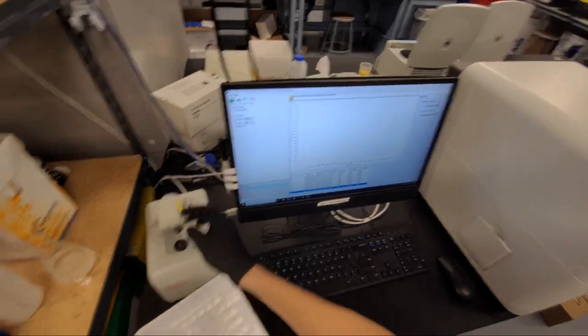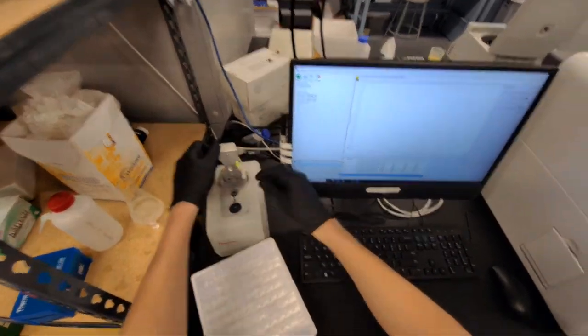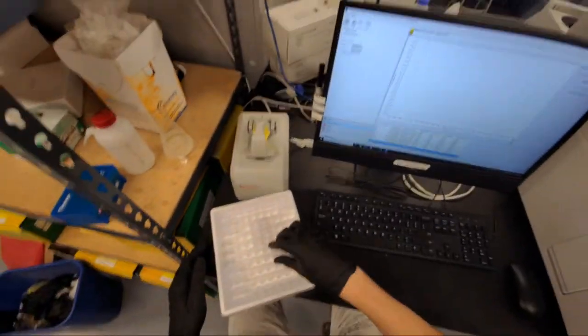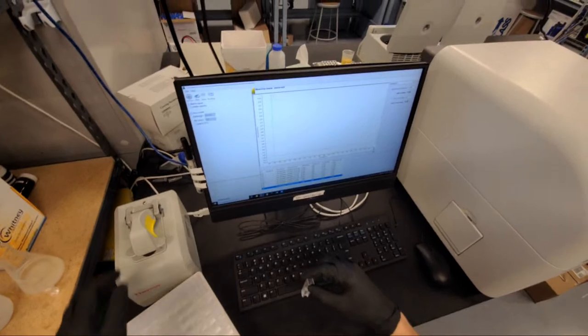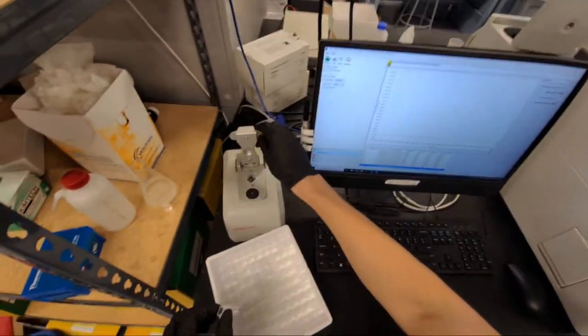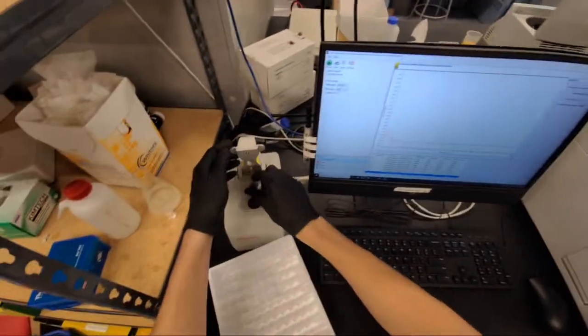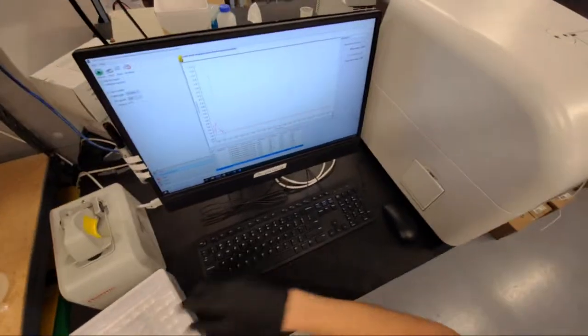So we will need to multiply all these readings by 20 to get the proper measurement. And that last one, it was 0.359 and then 0.337. Not too bad. But that's why we want to do these technical replicates because there is going to be a little bit of variability in all of these. And then finally at the end, I like to measure the blank one more time. So that last one was 0.289 and 0.274. And then the blank measures 0.003. So we call that good enough.